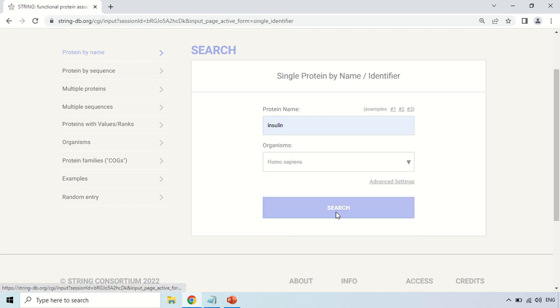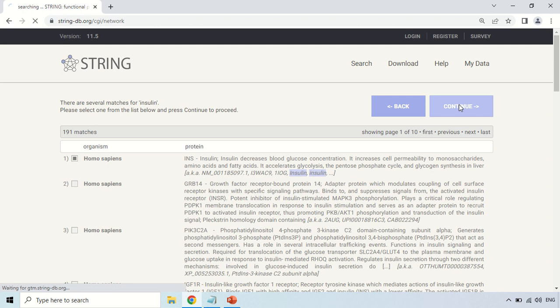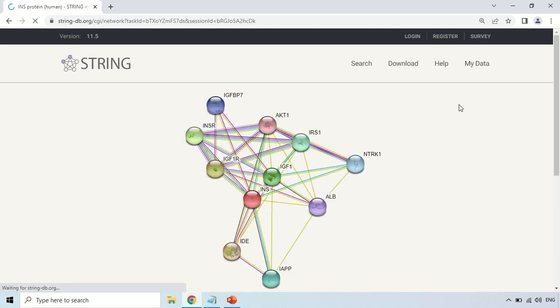Just double-click on Homo sapiens and it will be selected. Now just press the search button. As you click here, it shows the search results for insulin — the first one is Homo sapiens, with abbreviation INS, meaning insulin, along with the functions of this insulin. Just check the protein about which you want to see its interaction, and click continue.